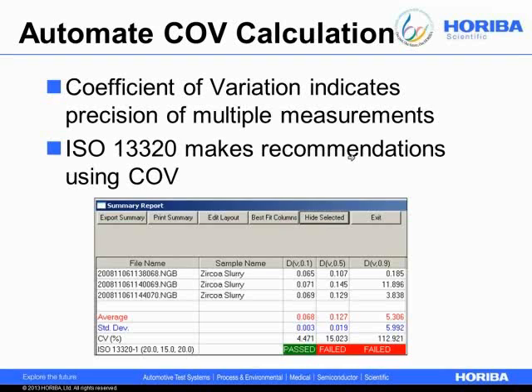So at the very least, you'll want to mix it up, and you'll want to take multiple measurements from at least different points in the jug or whatever container is being delivered into your lab. And what that'll do is it'll hedge your bets that you're not relying on a size result that came from maybe not the best sampling or maybe not the best dispersion. And the good news is, in the LA950, we have tools to make this kind of averaging process much simpler and easier to use.